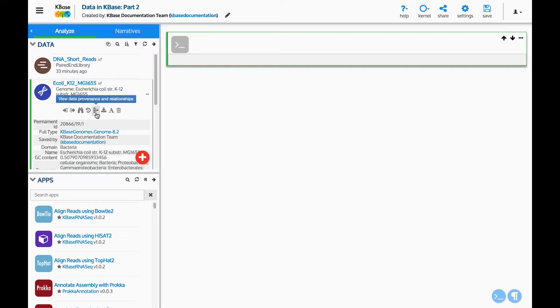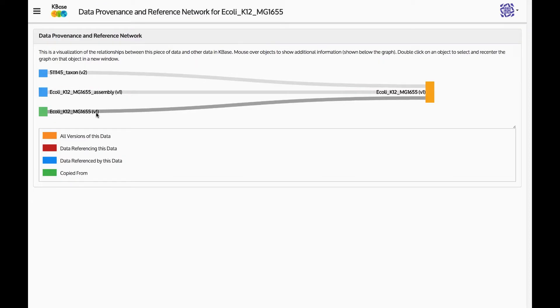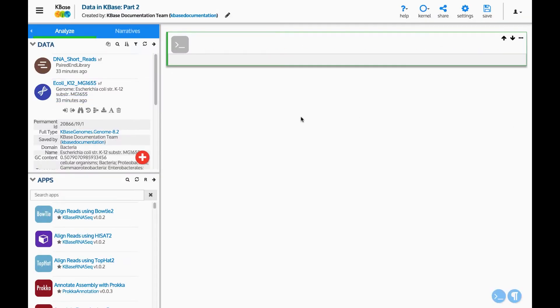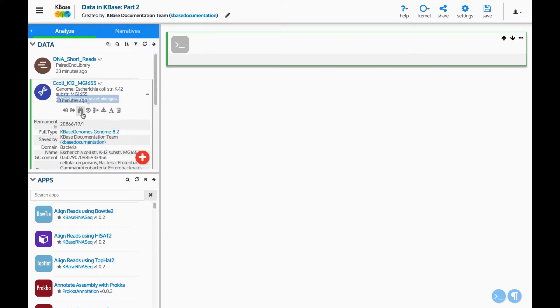This button shows the provenance of the data. Clicking it opens a new window showing the data and apps used to create this piece of data. The clock button allows you to see older versions of the data in case you want to revert it to an earlier version.